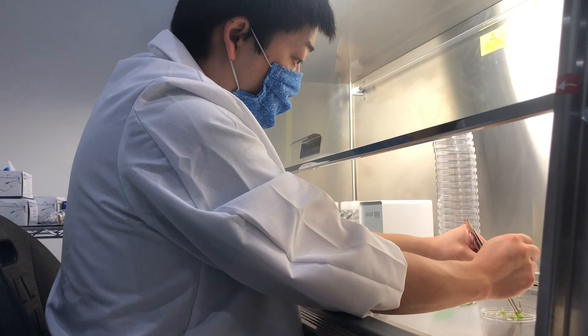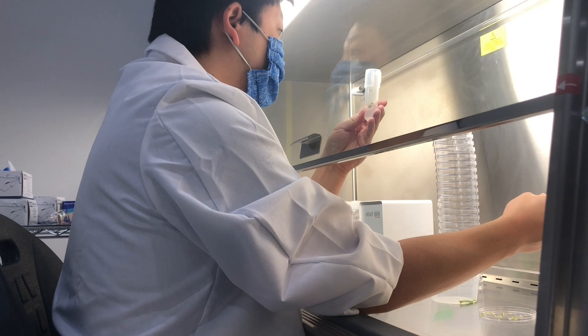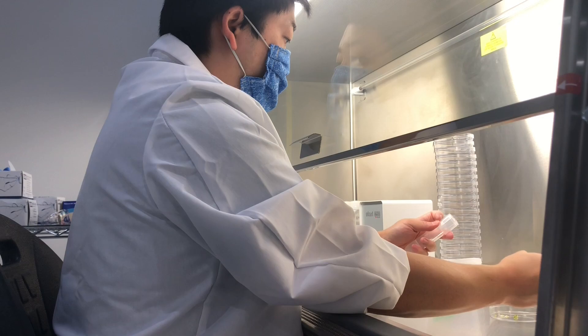Once my material is divided, I carefully pick up each section and place it into the test tube. It's really important to make sure that each section is right-side up. Remember, what we want the plantlets to do is grow shoots and leaves. If we place them upside down, they'll actually start growing roots, which isn't the end of the world but isn't super useful either. If that happens, we have to cut off the roots and kind of start over from scratch with that same material.